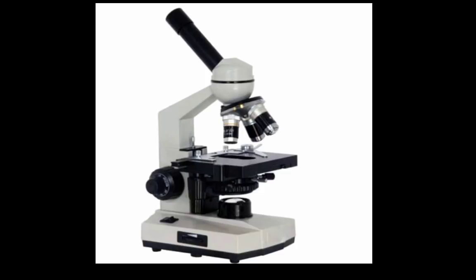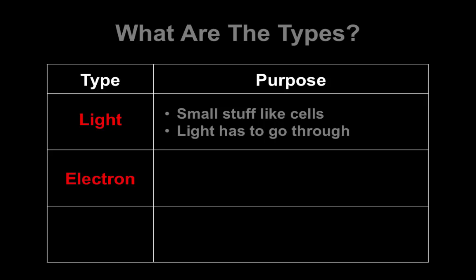So this is a light microscope. This is kind of the standard microscope that you think of, and we're going to be using these at least a number of times in this class.